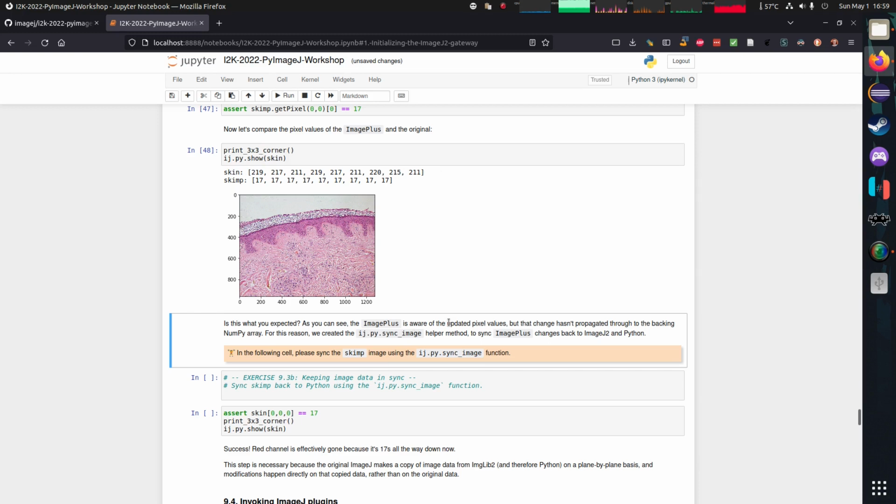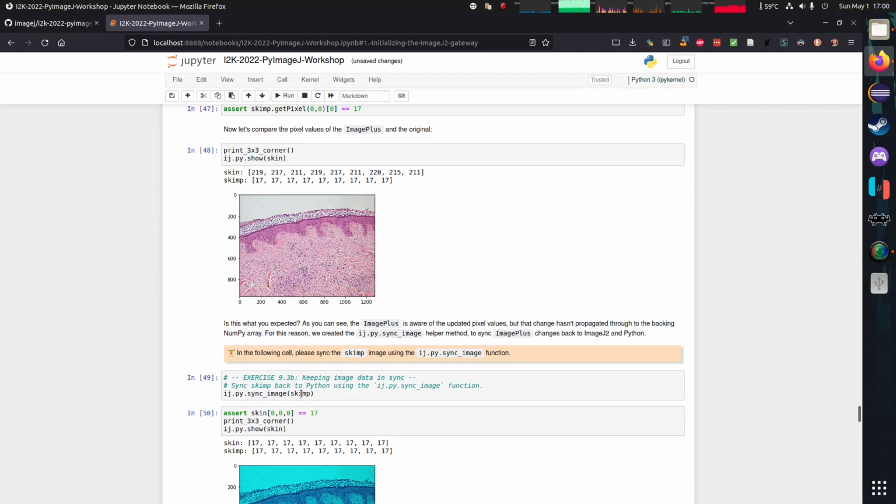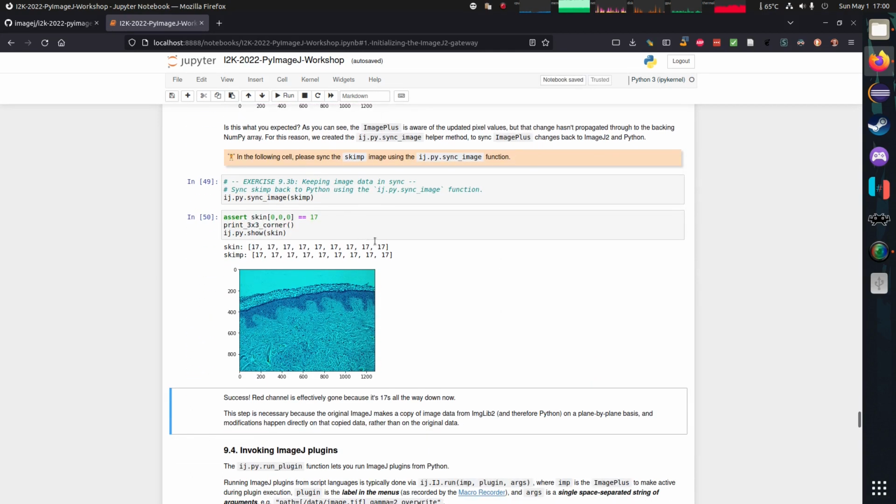The reason that happened, like I said, is because we haven't synced the data back. We can do that using the ij.py.syncImage function. So to complete this exercise, we're now going to call that function. Pause the video and try it out. All we have to do is write ij.py.syncImage and say which image we want to sync, skimp. And then we see that in fact the skin has now got the changes, and the color has changed because we're currently on the red channel in ImagePlus land, and we just changed those all to 17s, which is close to 0, and so the red really disappears now in this image.